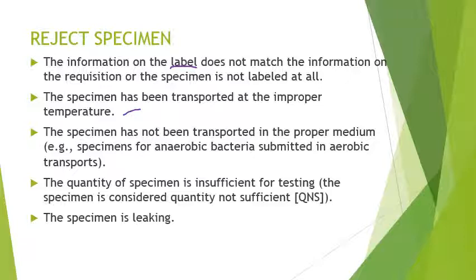For the urine sample, ang nadala na sample sa inyo would be midstream catch. So, hindi nyo tatanggapin yun. Another is your quantity of specimen is insufficient for testing. Note, dapat may quantity na sufficient, pwede nyong i-reject kapag konti lang. And if the specimen is leaking, specifically pag urine.